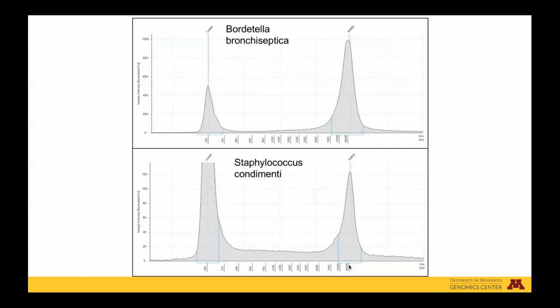The size of the DNA product from these extractions needs to be above around 40 kb for this multiplexing protocol. This protocol is much more forgiving than larger insert protocols for PacBio, and it's certainly more forgiving than, say, nanopore might be if you're going whale hunting for super long reads.